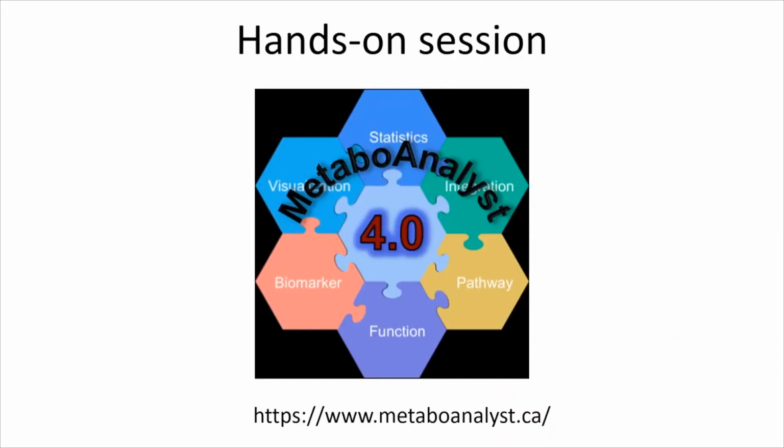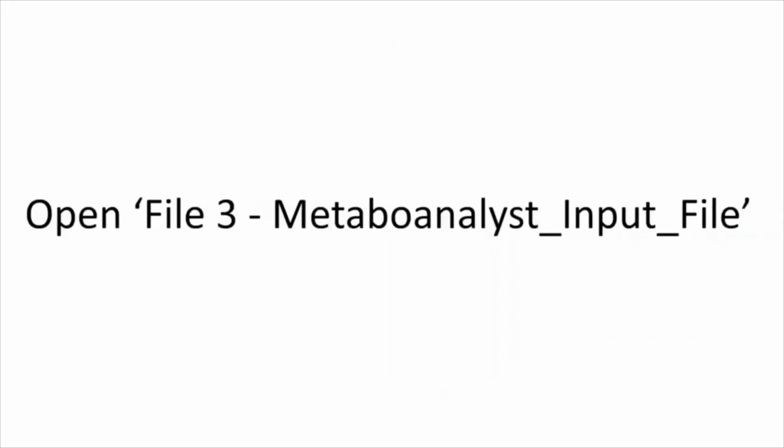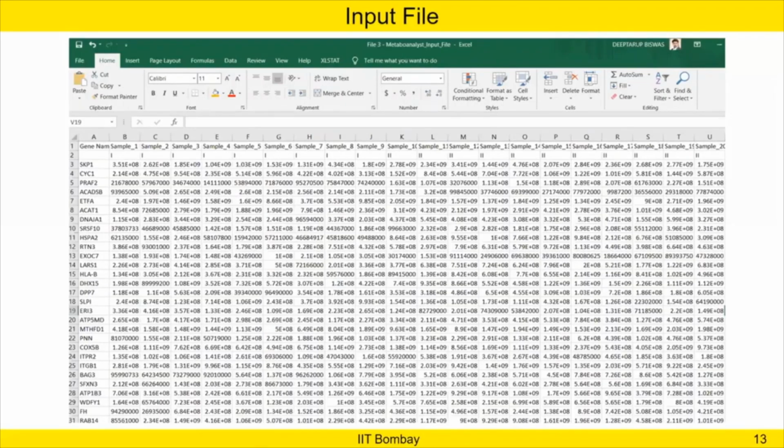So I will suggest you keep all the files that we have shared with you ready for the analysis. And first, I will ask you to open file 3, that is the Metaboanalyst input file. Before going into Metaboanalyst directly, I will spend some time on the input file. So we should be very much familiar with the file that we are using for Metaboanalyst or any kind of statistical data analysis.